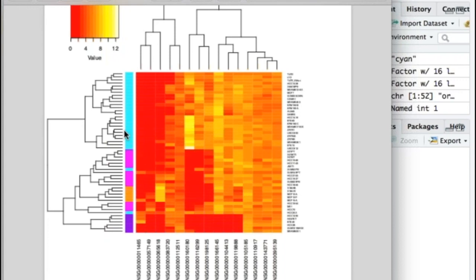So, as you remember in the previous session, we wanted to look at the differential expression, or sort of the difference in expression between the normal line and the claudin-low. So could you make all other colors white and just make claudin-low red and normal-like light green? Can you make this heat map with those colors? So we just look at the difference between claudin-low and normal-like.